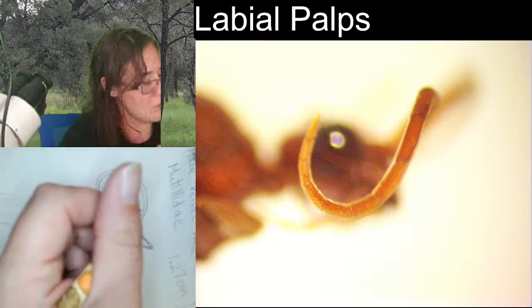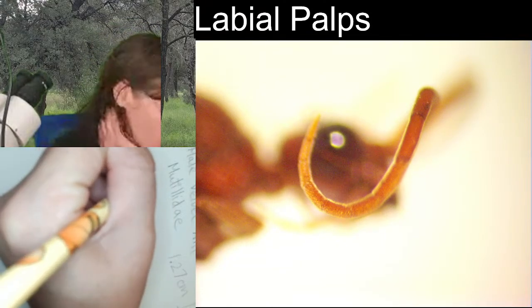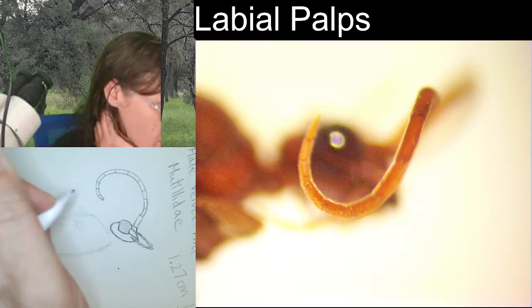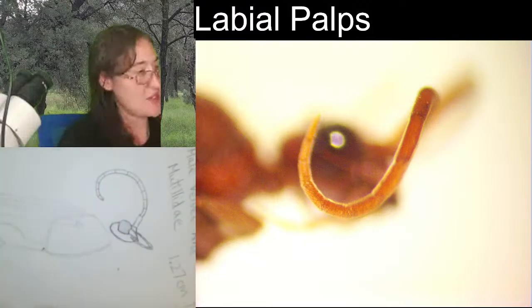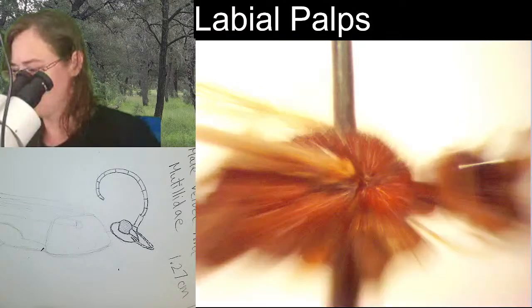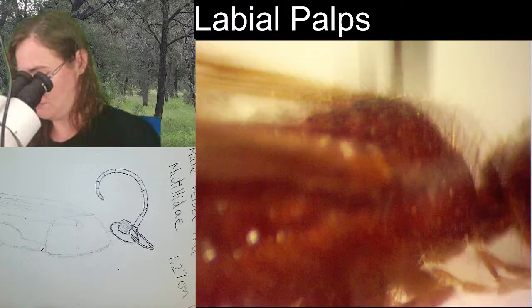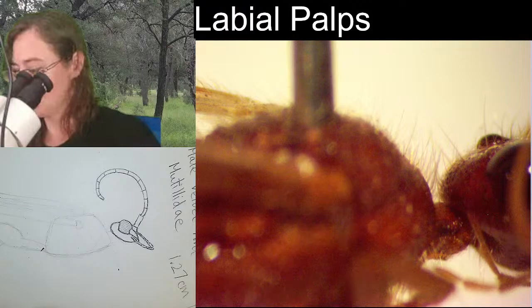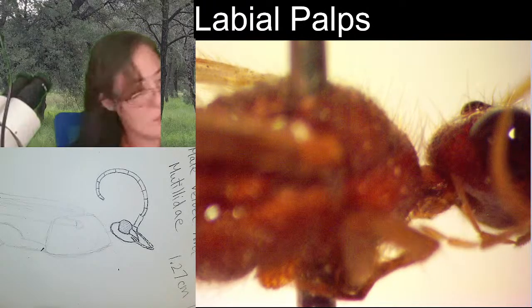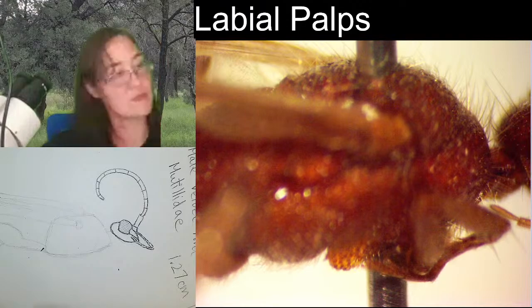Not horrible. Alrighty. And I said 12 segments. So this is 1, 2, 3, 4, 5, 6, 7, 8, 9, 10, 11, 12. That actually didn't turn out too bad. Rewrite Velvet Ant up here so it doesn't just say labial palps for the entire class.